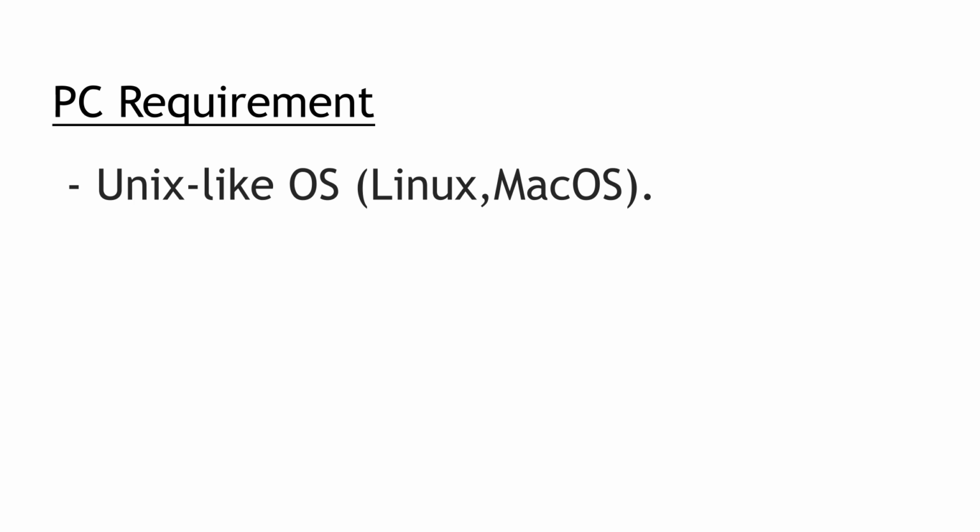Now, in terms of PC requirements, you need to have a Unix-like environment. That is what I used anyway. So Linux or macOS will be fine. I've not really used Flye on a Windows machine, so I'll not be able to tell if it works or not. Probably you may have to contact the developer, but it's going to work on a Unix-like environment. So just make sure you have one: Linux, macOS, etc. Aside from this, you should also have Anaconda installed on your system.